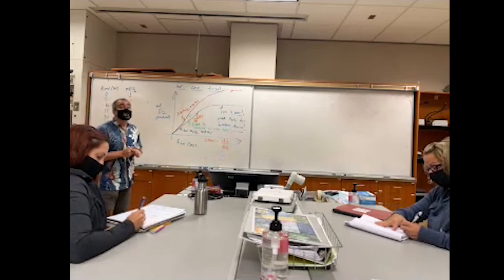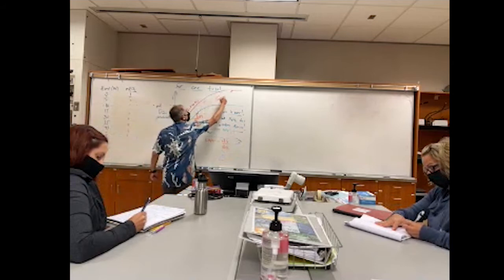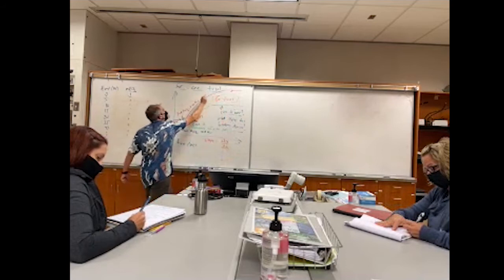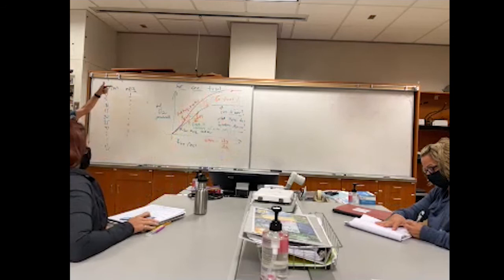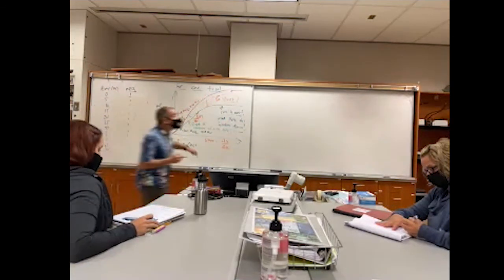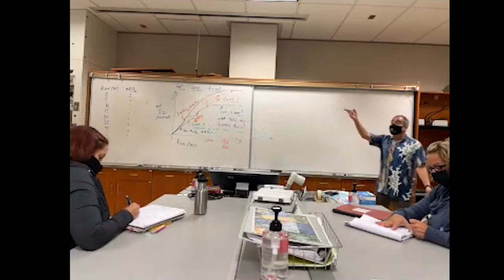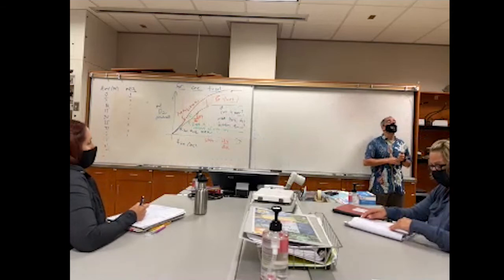And then what you're going to do after you do this 5 or 6 times, one trial, another trial. Again, we need to do a trial at all the different substrate concentrations that we're going to be playing with. Then we're going to have to make another graph. Because what are we really looking for? We're looking at the relationship of what and what.